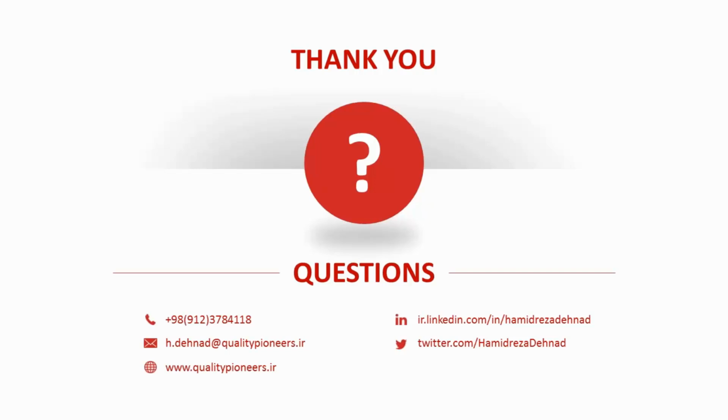Thank you. Another question is, is there a difference between duplicate and replicate analysis as elements of QC mechanisms? Yes, duplicate means repeating a test when everything is constant, nothing is changed. Even the time is very important. You repeat one after another. This is called duplicate. But in replicate, the situation is reproducible. Different operators perform the same test at different times. I test the same item at different times, and then I compare the difference with the critical value. This is the difference between duplicate and replicate.